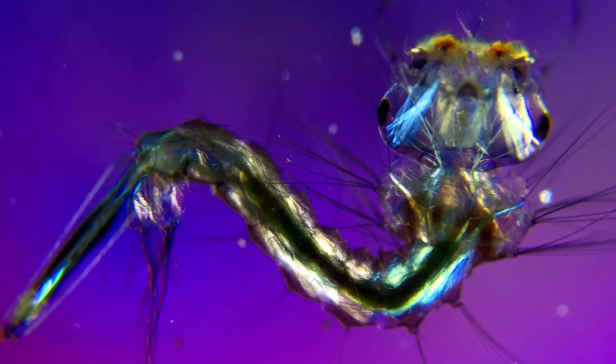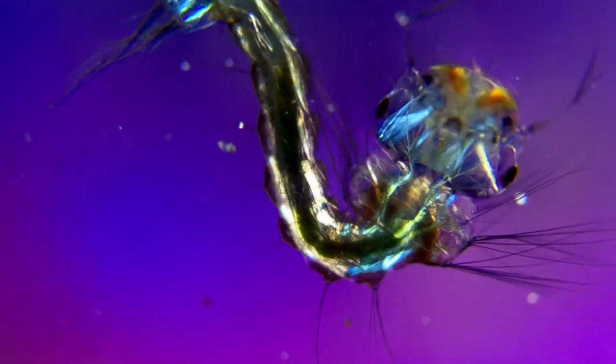Another more well-known larva that uses one of these breathing tubes is our dear summer friend, the mosquito.